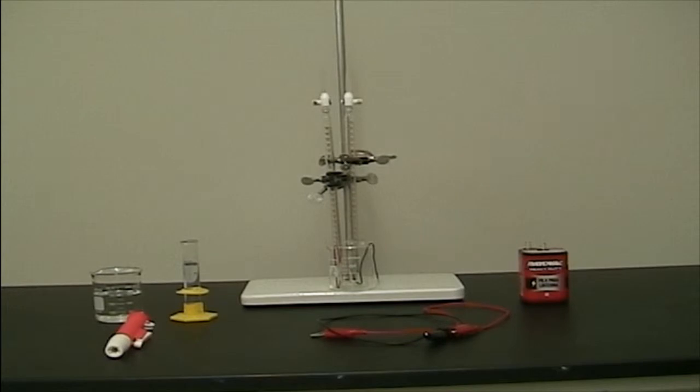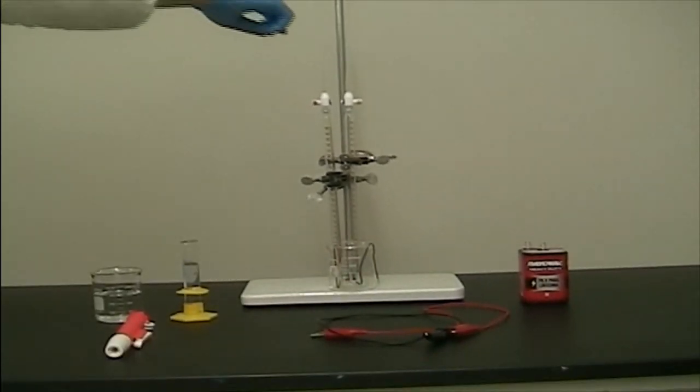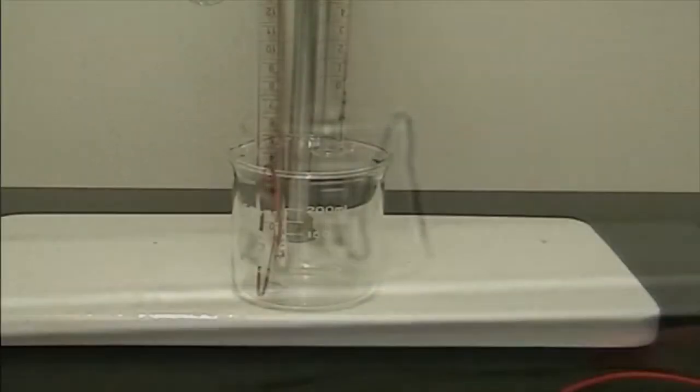To set up a small-scale electrolysis apparatus, instead of using test tubes, as the literature usually recommends, we used two 25 milliliter glass burettes that were secured by two 3-prong clamps attached to the same ring stand. These burettes were suspended with their valves pointing up next to each other, so that their open ends were pointing down, immersed in an empty 250 milliliter glass beaker.